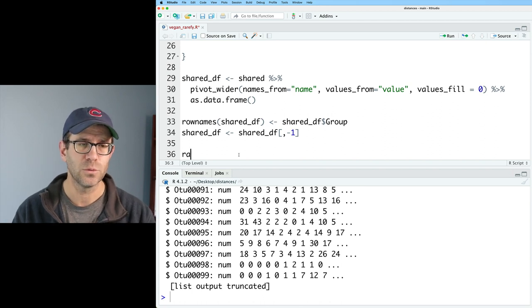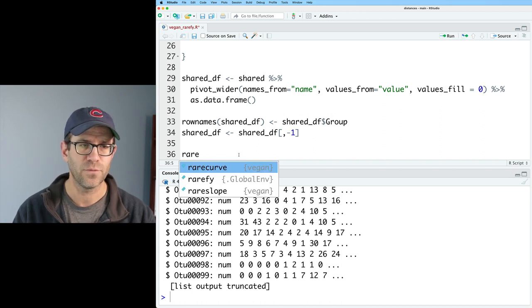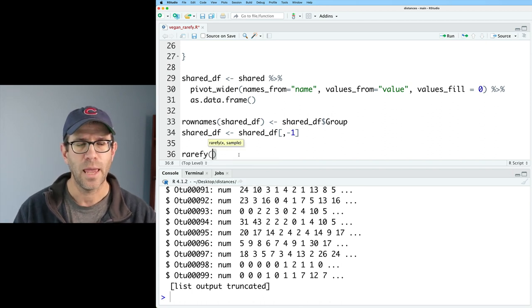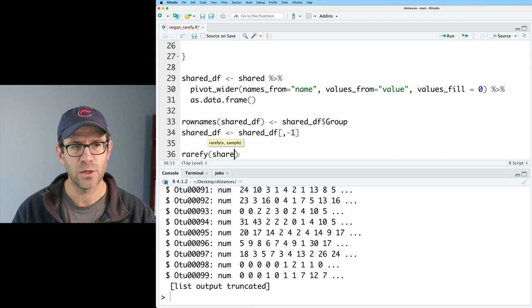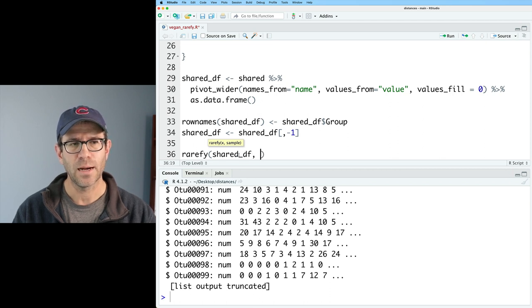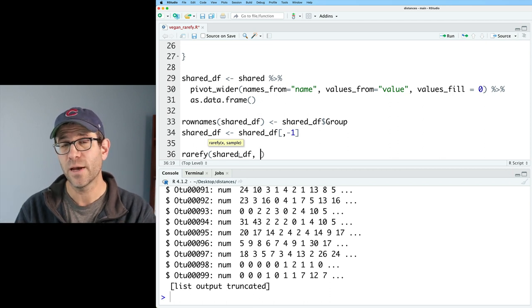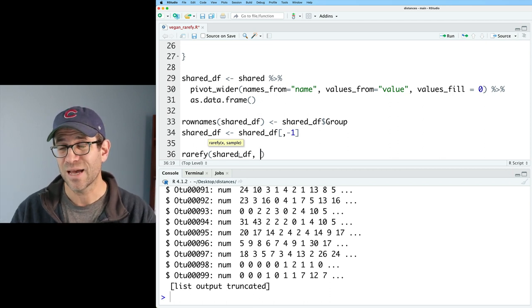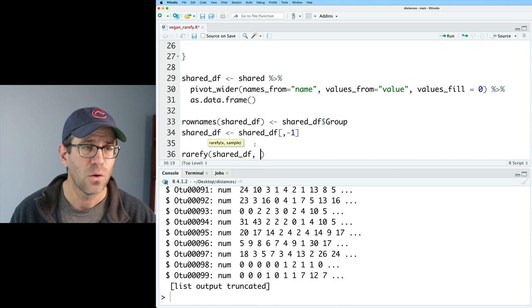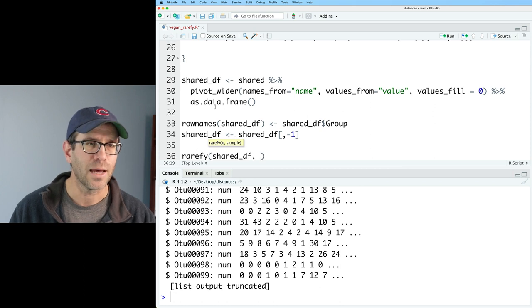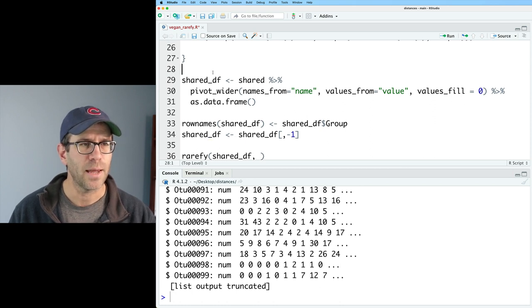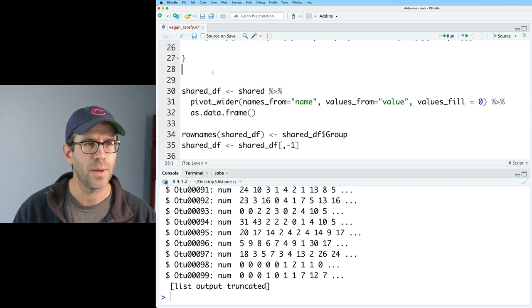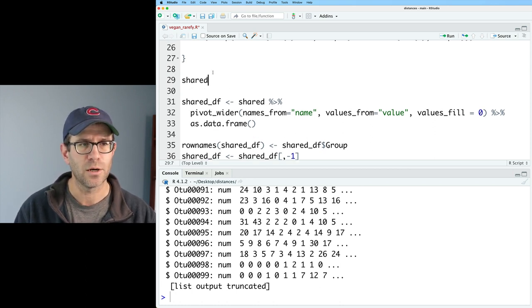And so what I will do is to do rarefy. And I will take shared_df. And I'm going to rarefy it to the smallest size sample. Well, how do we get that? Well, let's step back here. And let's go back up to shared.